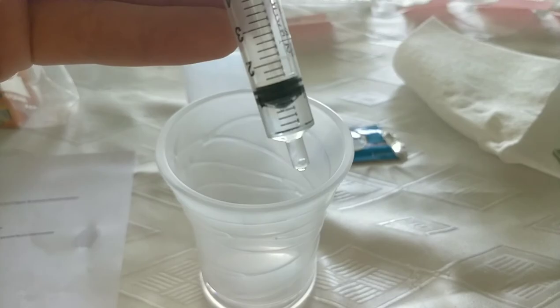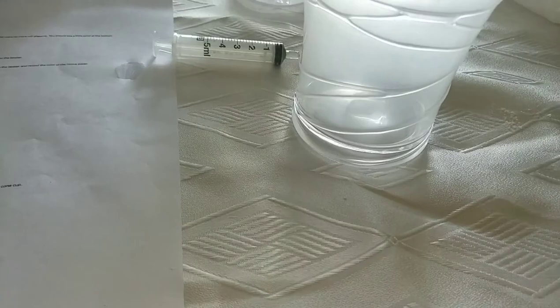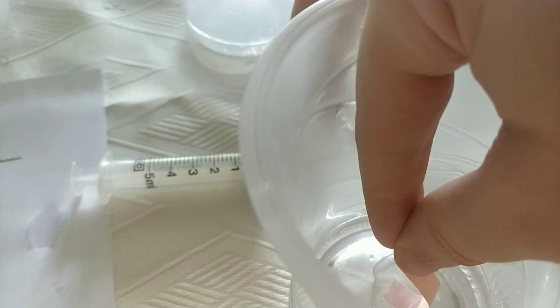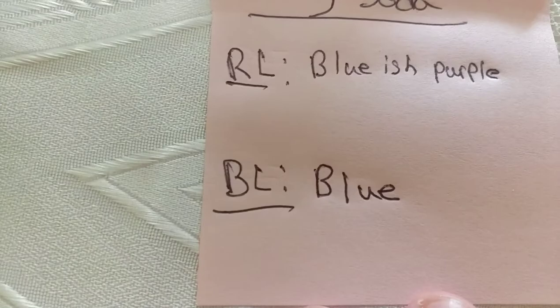Here I have one milliliter of the Alka-Seltzer solution and I'll put it into this cup. I'll first test it with the red litmus paper — I'll wait a second and record the color. The red litmus paper turned bluish-purple. After testing the blue litmus paper it stayed blue. Now I'll move on to the antacid.